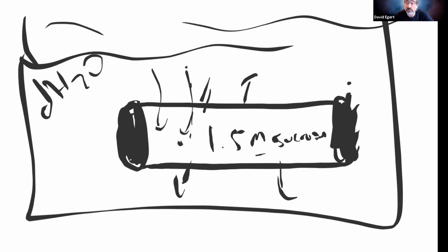Whether it popped would depend on how strong the plastic is, and how tight the clips are on the edge. When we do this in lab, I actually do have to be careful. If I leave that in the water too long, they literally do explode. But the plastic is strong enough that it can hold on for a couple of hours before it fails catastrophically. So watch this and you can see the tubes in action.